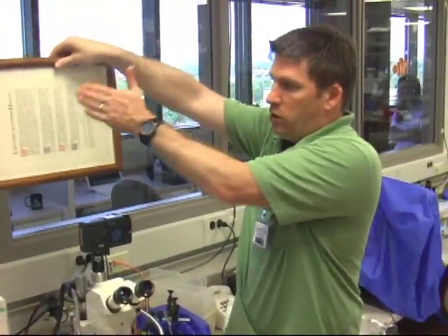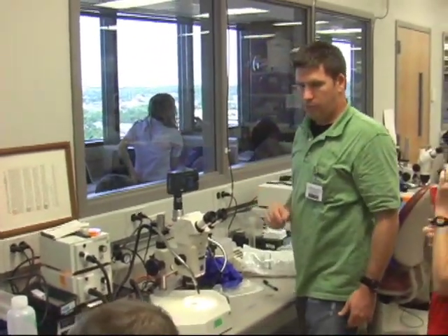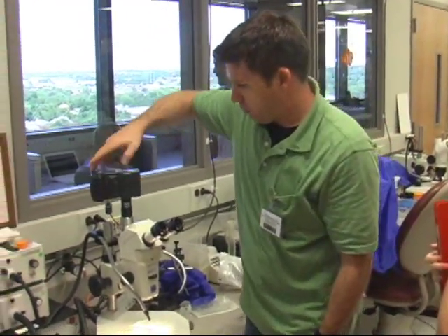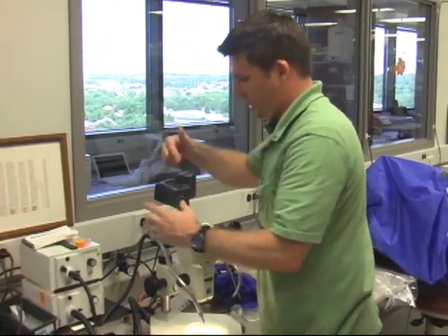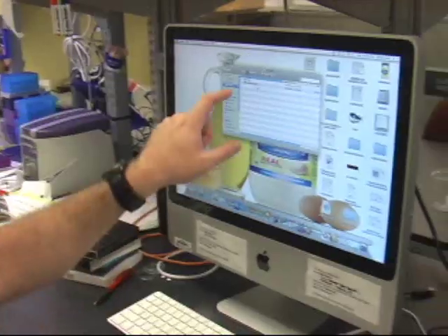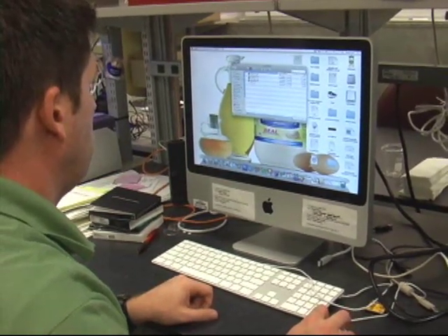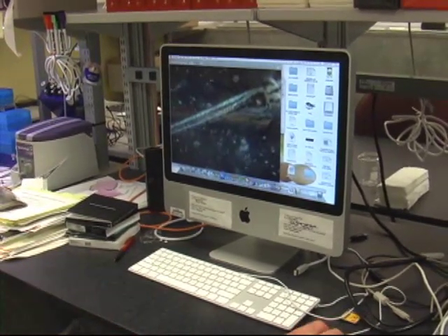Whether you're looking down at his head or at his side, he'll always face left. This fish is looking to the right, so I can take the picture and then flip it. Now technically, thinking of where the Nikon is, he's looking to the left — does that make sense? I'll open this up and here are the pictures we took; the last one is going to open up in preview and it's a little fuzzy.